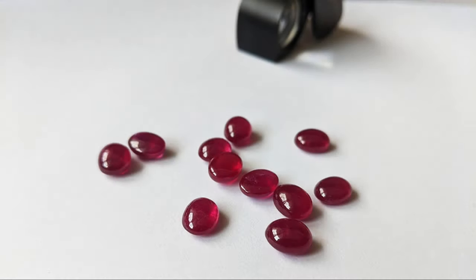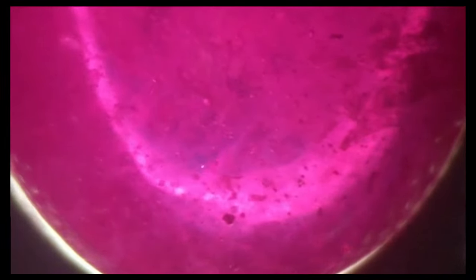All right so the second microscope beauty I'm going to show you right now is the cabochon rubies which are again looks like they're natural stones. So the first thing you'll notice under microscope is these all these spots around the whole stone. These spots are actually gas bubbles which again it's a clear indicator that this is a flame fusion ruby.